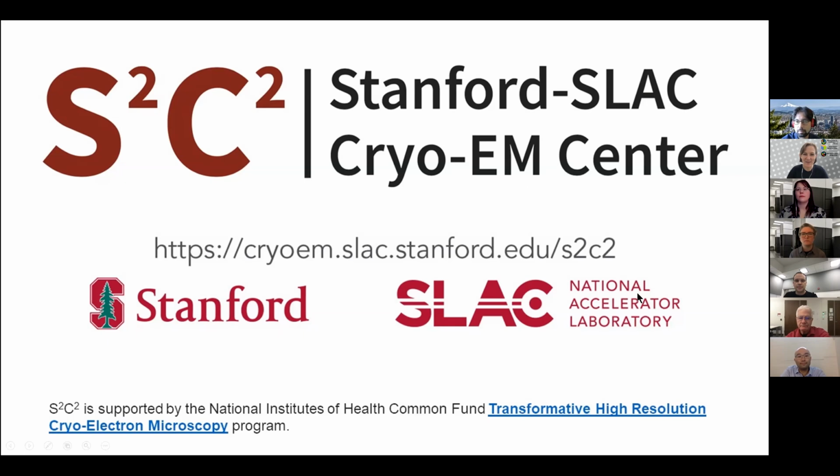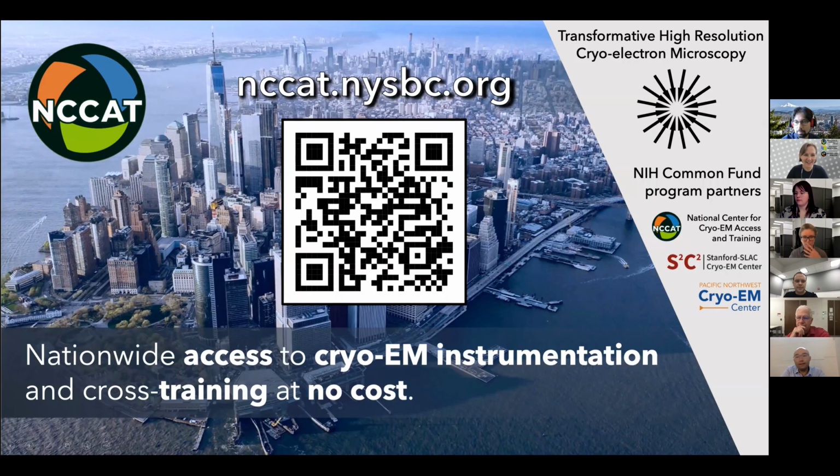And up next is Ed. Hey, my name is Ed. I am here in New York, where NCCAT is housed at the New York Structural Biology Center. We offer access to 3, soon to be 4 Titan Krios instruments, as well as blot-free vitrification through a Chameleon device. Something that we are really trying to promote is cross-training.